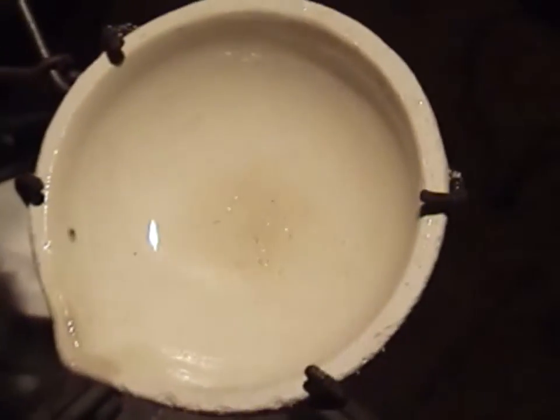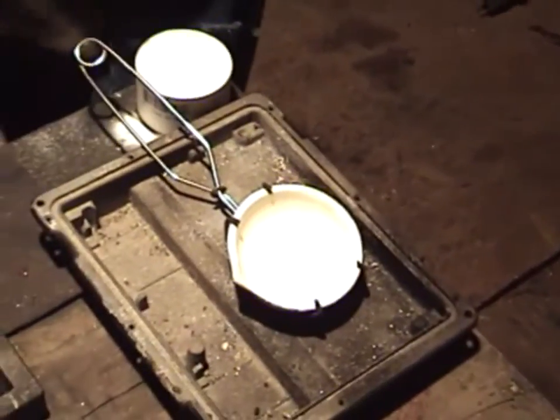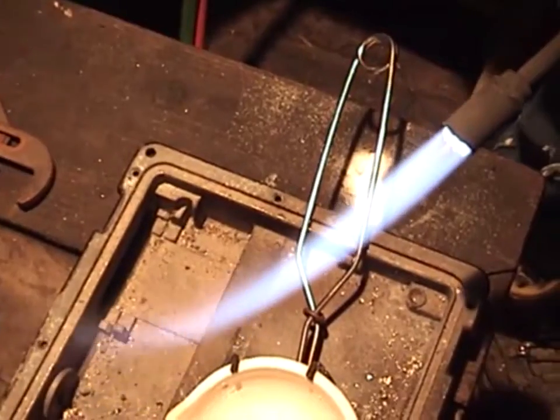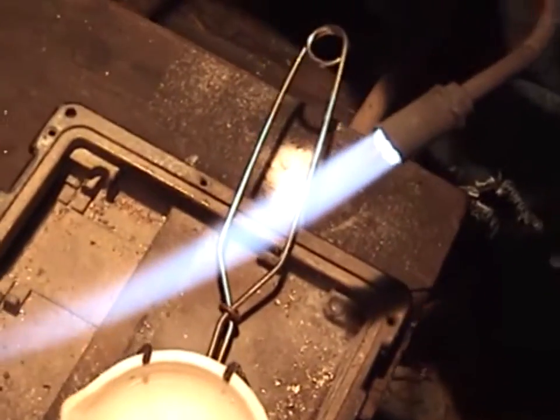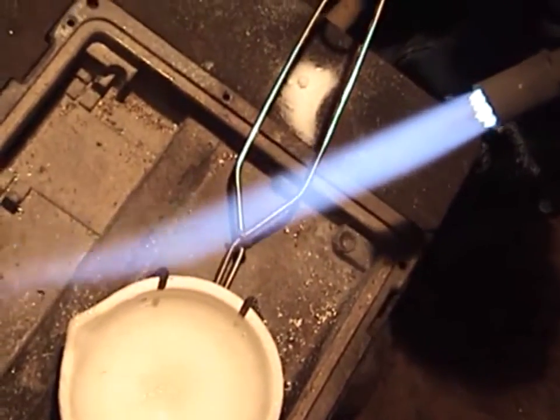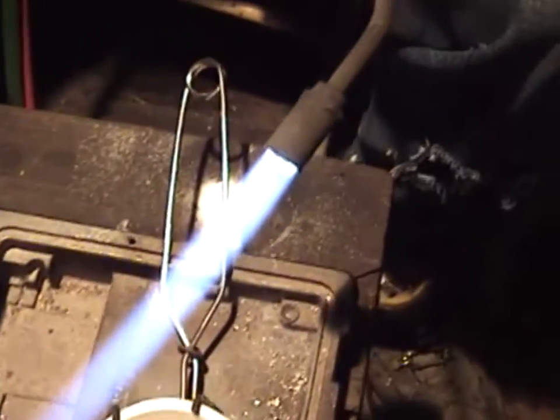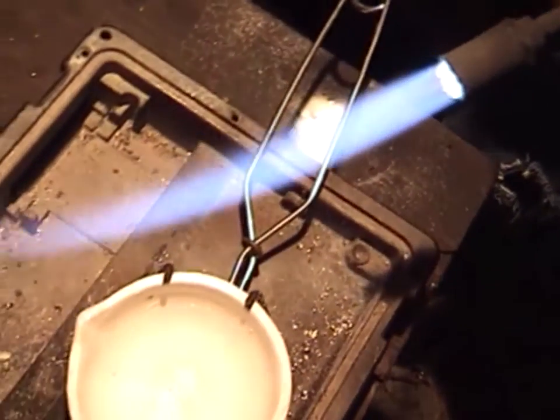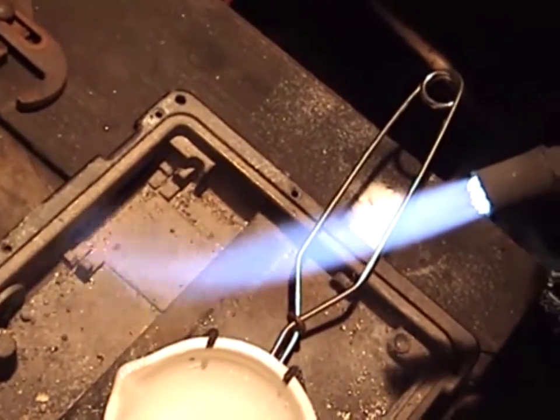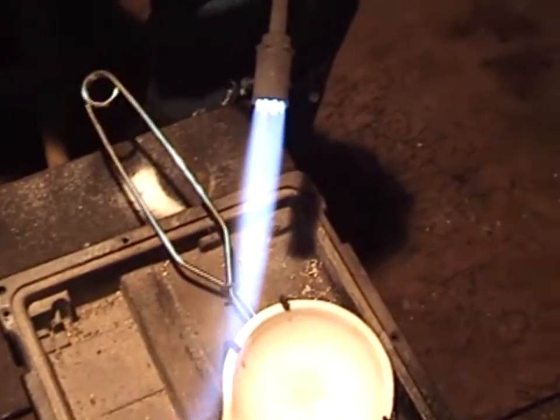Alright gentlemen, before I show you how to melt this silver I need to tell you a little bit about technique. What you see here is about a normal flame — the gas mixture and the oxygen mixture are just perfect, giving you a neutral flame. Now there are two other types of flames: a reducing flame and an oxidizing flame.